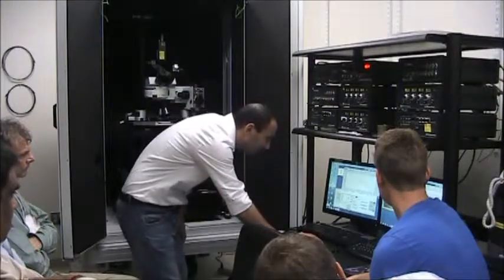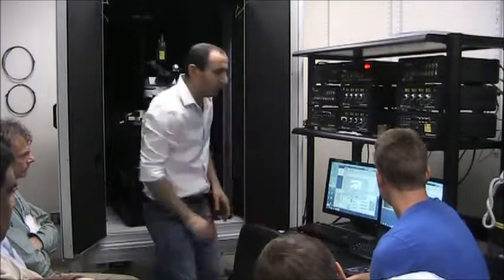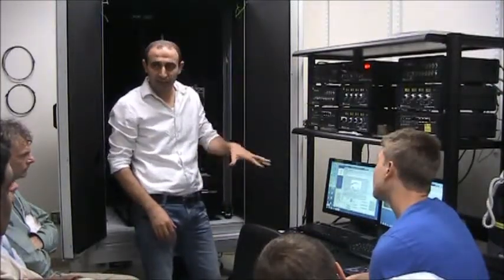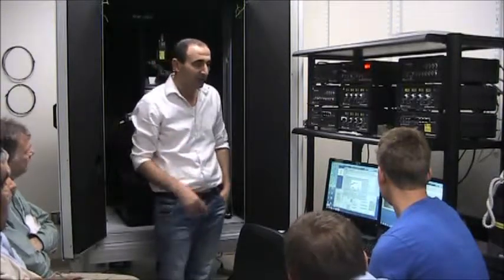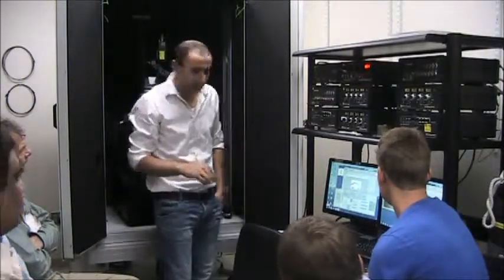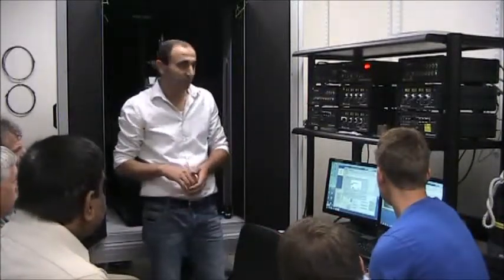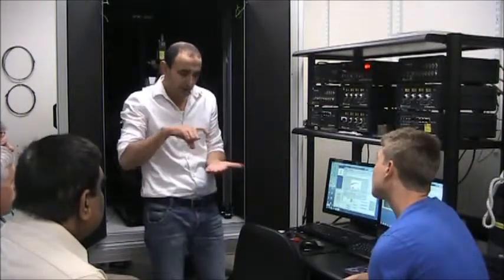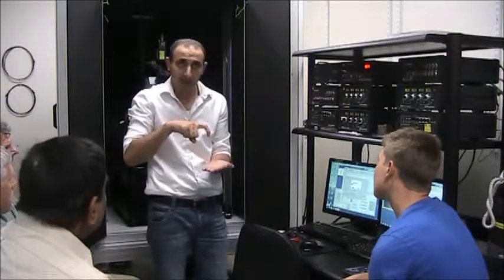So let's approach the tip. Not directly to the surface, but slightly before, a few microns above the surface, and then we switch to the 50x objective, so we'll have a better field of view, and we'll see the advantage of these exposed tips when they're touching the surface. So the tip is coming down now. The approach process is done with a Z stepper motor, and this is linked also to the Z piezo. So we ensure that the engagement with the sample is done in a gentle fashion.